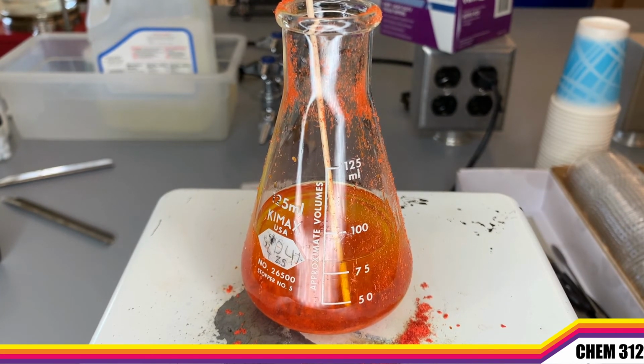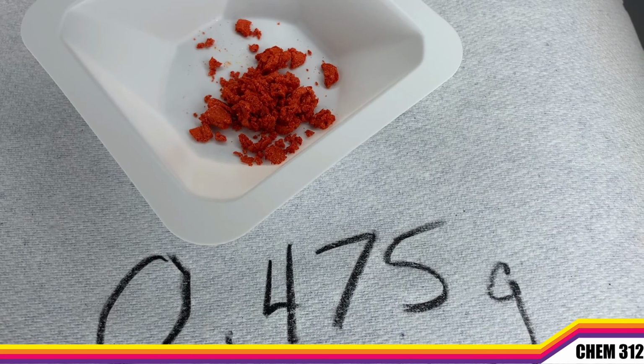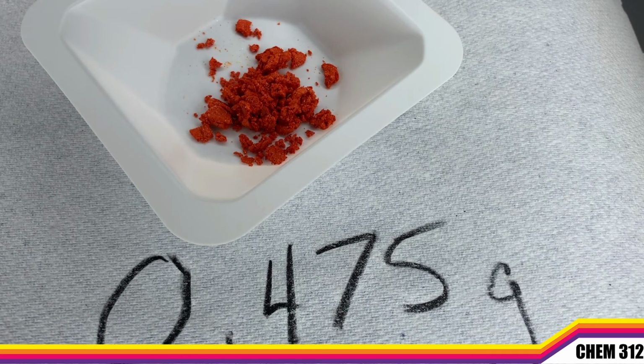We'll see how much we can purify by recrystallization. For my large-scale recrystallization, I was able to re-isolate 475 milligrams, or 0.475 grams, of that imine product that we can now use. This is from that larger scale recrystallization. Use this to determine the percent recovery for our imine product. This relates to what we did last week in our previous experiment.